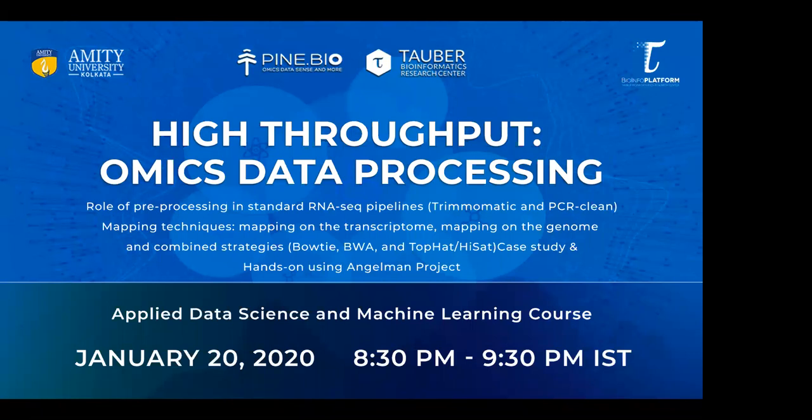Today, we are going to learn about NGS data analysis and the different algorithms that are used to turn this raw data into information that makes sense. With the NGS data that we are generating, from the samples to the reads, we are trying to process that data. Why? Because these experiments have their own limitations.